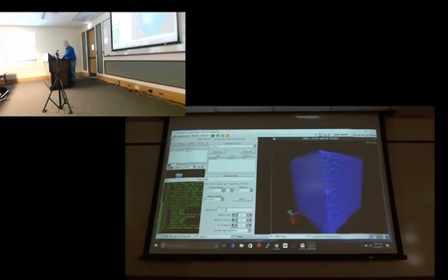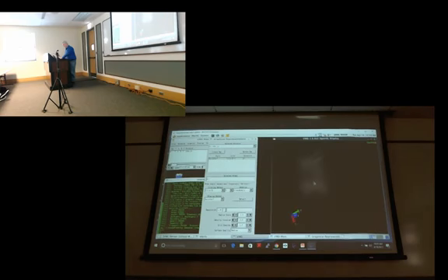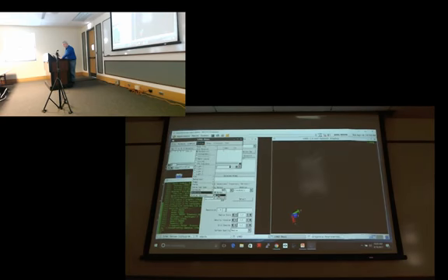So that's the whole periodic cell of this satellite tobacco mosaic virus. I can then change it to this glass bubble. And then I'm going to change the rendering mode to high quality. So this is a little idiosyncrasy of VMD. By default, it has 2 ways, or 3 ways, of using OpenGL. The default way is called normal, and it's significantly lower quality, but it works even on broken graphics drivers. And so we have that be the default because you never know. You update Yosemite to Sierra, and pretty soon your Mac doesn't work anymore. And this one will still work even under adverse conditions.